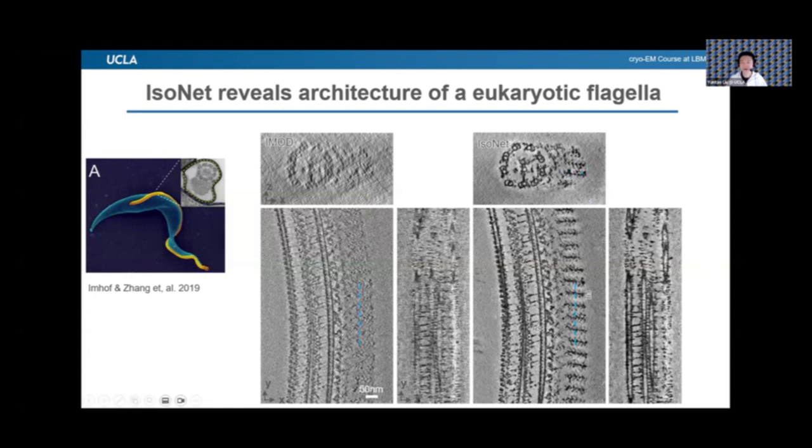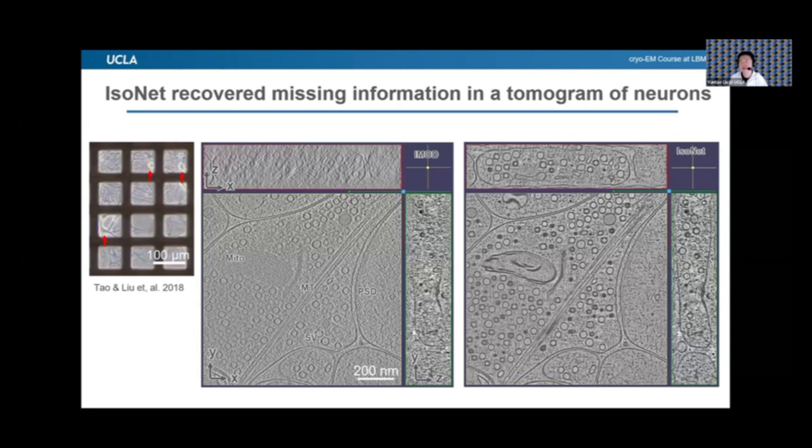So this is additional density that people haven't described. At that time, you can clearly see the pattern of the additional cryo-ET density. You can also notice that denoising actually helps, because the original data is very noisy, and after IsoNet treatment, the noise-to-noise strategy helps to visualize the microtubule and the outer arm dynein. This is the first flagella, and from the organelle, we'll move on to the cell sample.